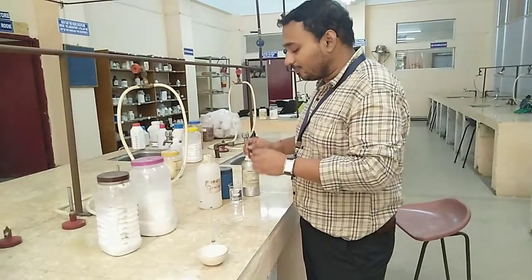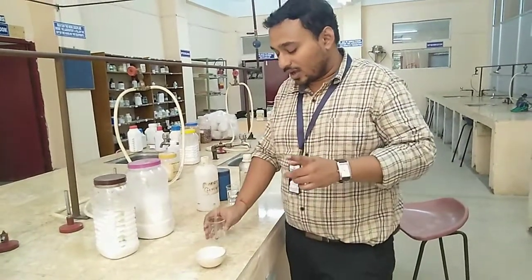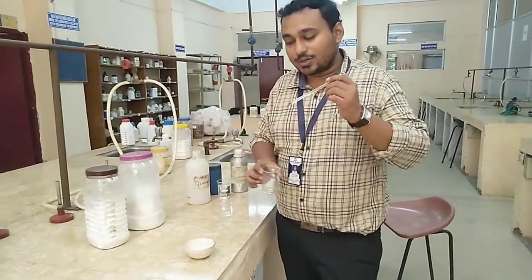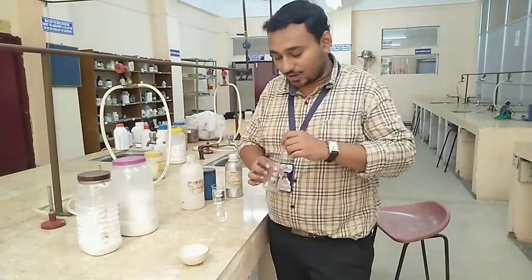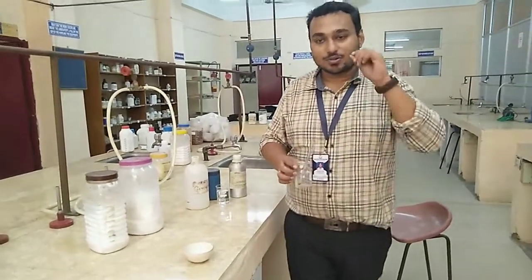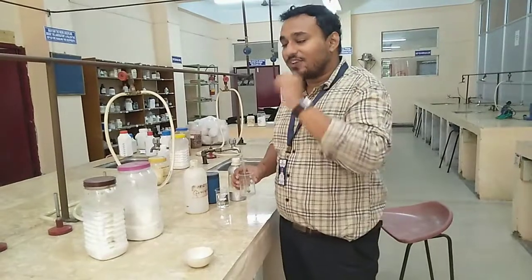Both liquid mixtures are then combined together into a bigger container and stirred properly. After proper stirring, we get a consistent mass of the vanishing cream.